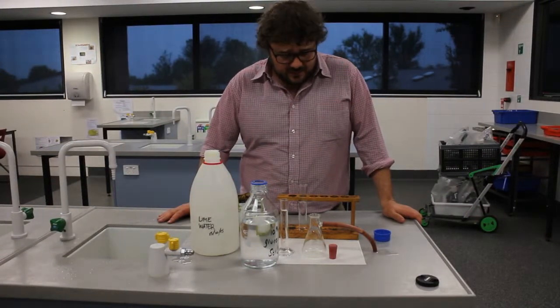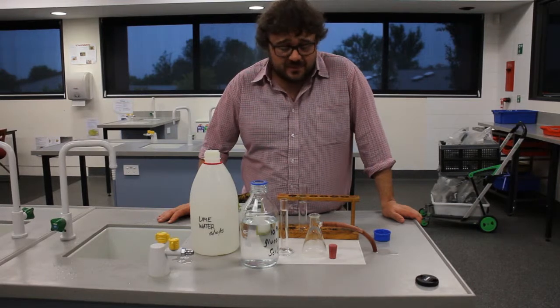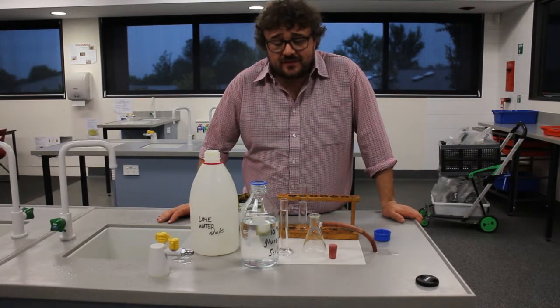All right chemists, here we go. We're going to look at how to set up our ethanol fermentation — the fermentation of glucose into ethanol.